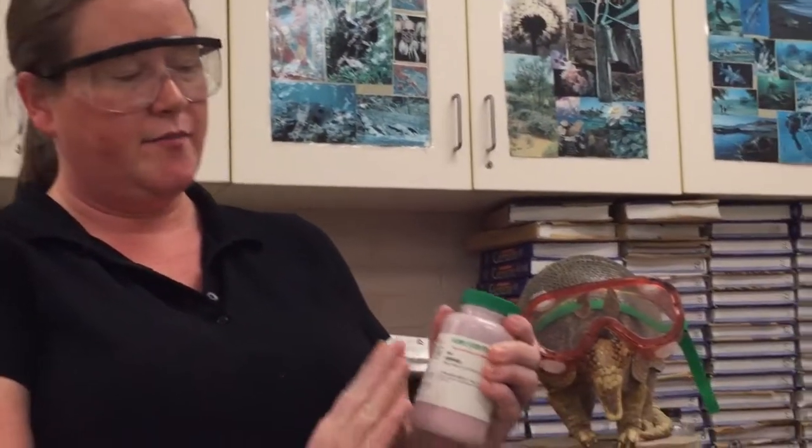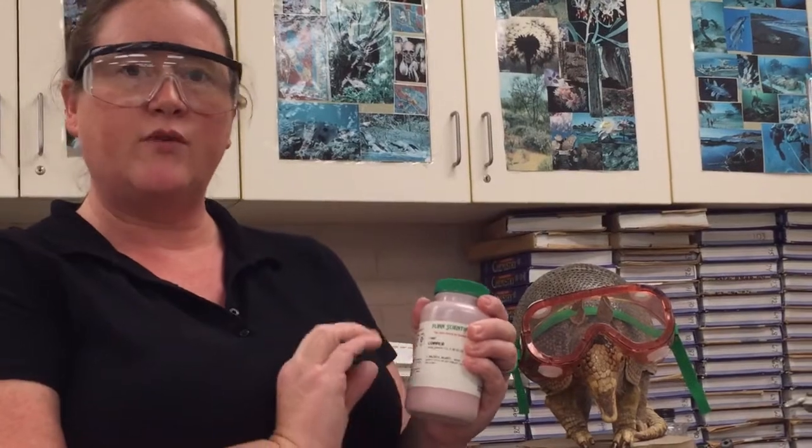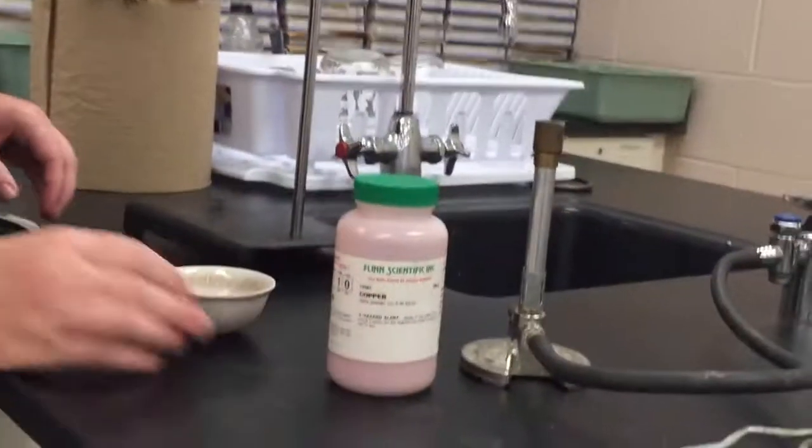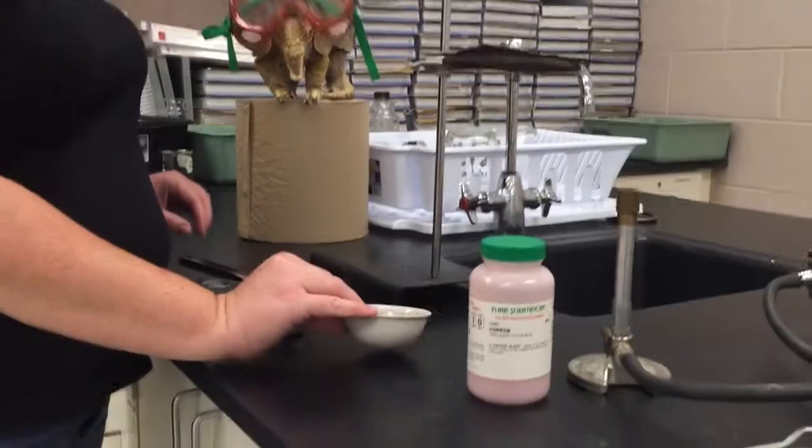In the lab, students took some copper powder. It is pure copper powder. There are only 100% copper atoms in here. And they placed it into an evaporating dish.